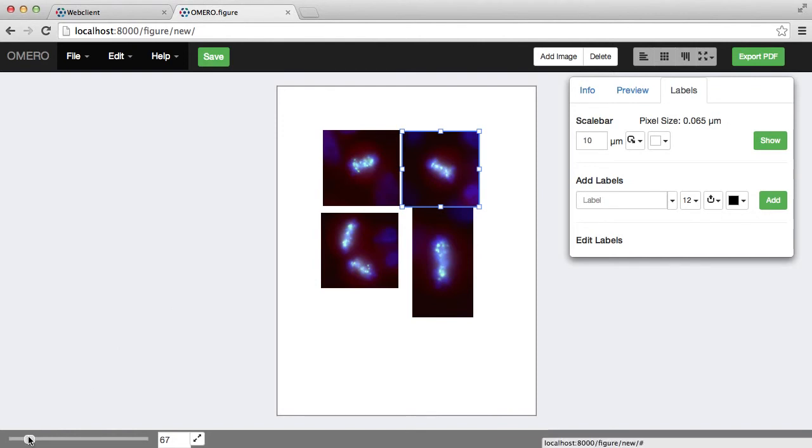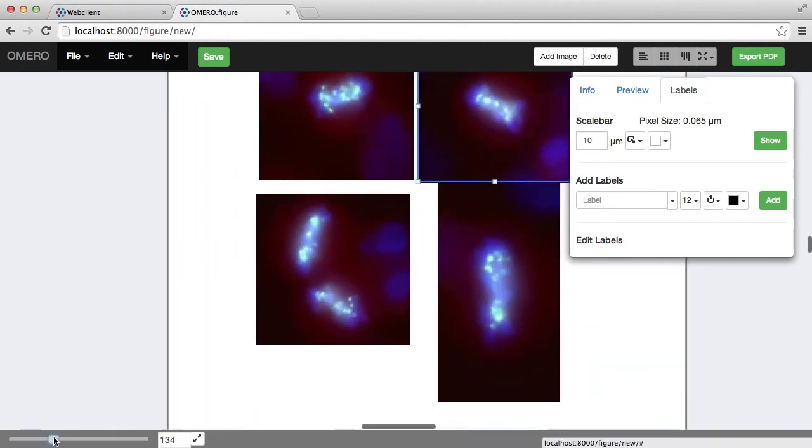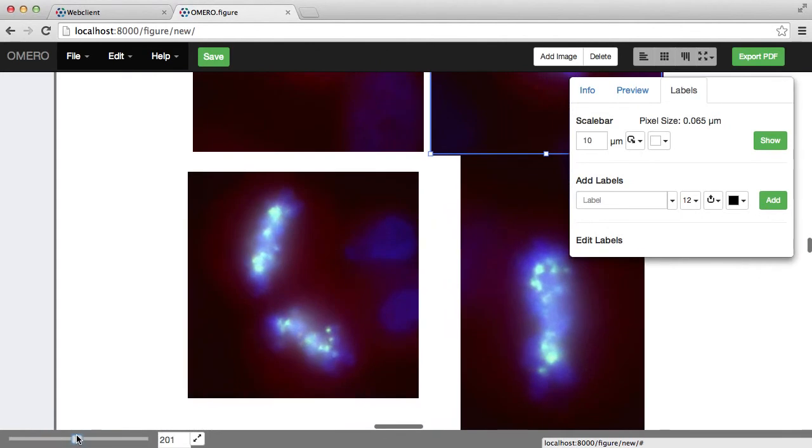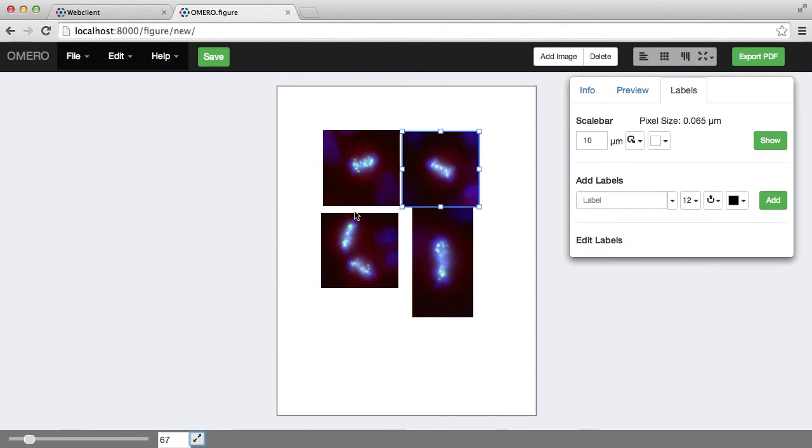And the whole window can be zoomed at the bottom here, and there's a button to make it fit into the window.